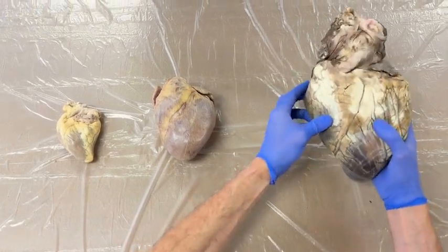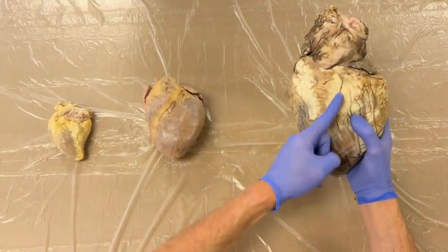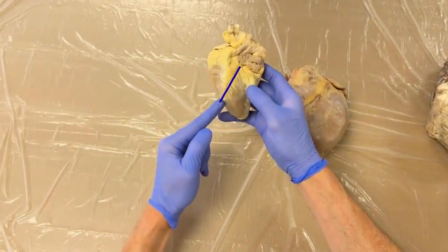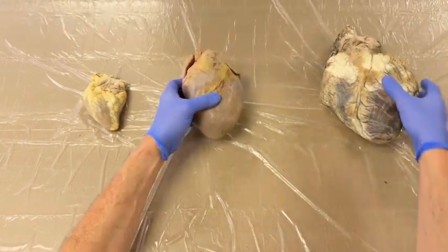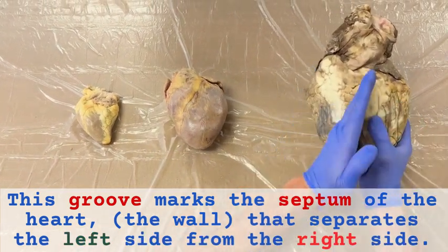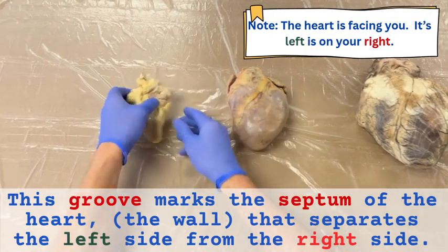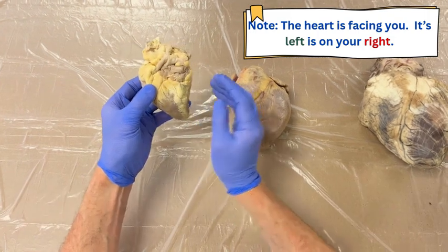Another big clue is that if you look at these hearts, you will see a line in a diagonal direction down the front of the hearts. Each heart has it. This is the pig heart, and this is the sheep heart. This is called the interventricular sulcus or groove, and this defines the septum of the heart that separates the left side from the right side. Here is the groove in the pig heart, right side, left side. And then the same groove in the sheep heart, right side, left side.